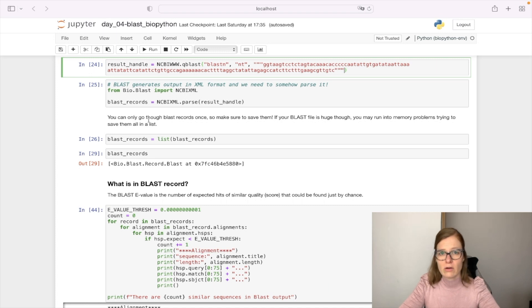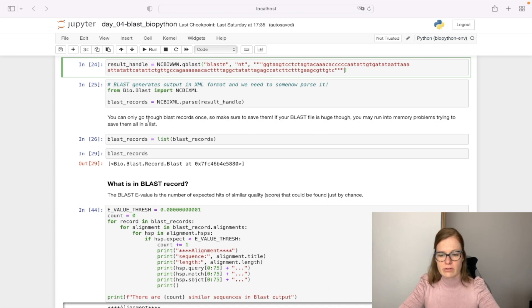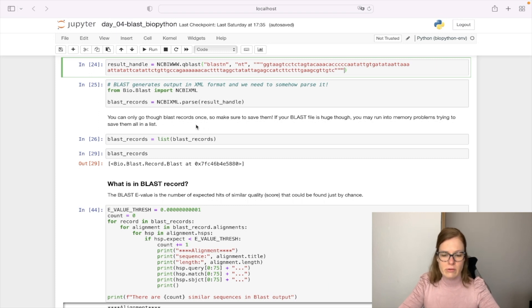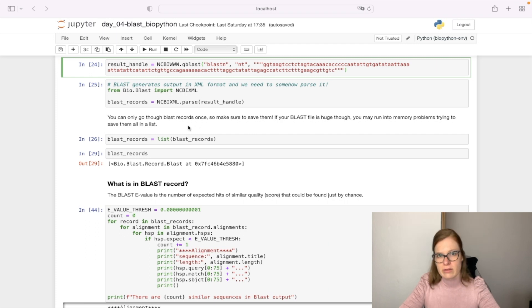We can only go through the BLAST records once, so we need to make sure to save them first. In this case the BLAST record is not so big, so I'm going to save it into memory. But be careful — if your BLAST file is huge, you may run into memory problems trying to save them all in a list. We can see that our BLAST records is a list representing only one BLAST record.